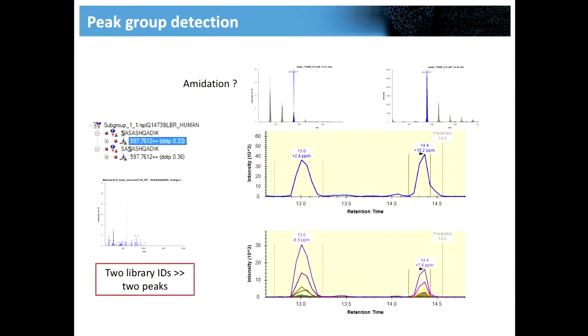We had 2 identifications in our library, but only one of the peaks corresponds to the mass, and the other peak corresponds to another mass. So we have this constant, I don't want to use the term convoluted, relationship between different combinations of modifications, plus the problem of site assignment. This is, of course, related to the size of the window that we acquired.